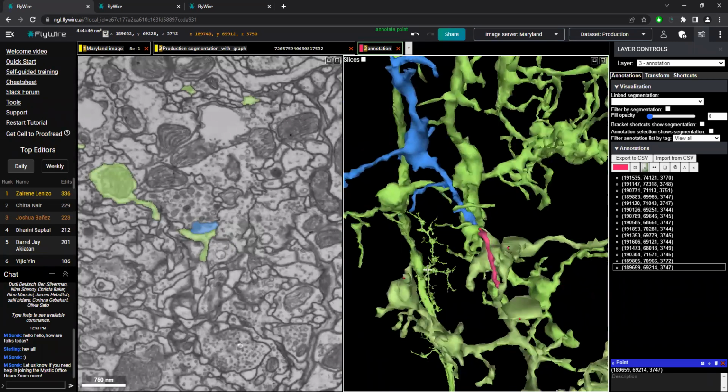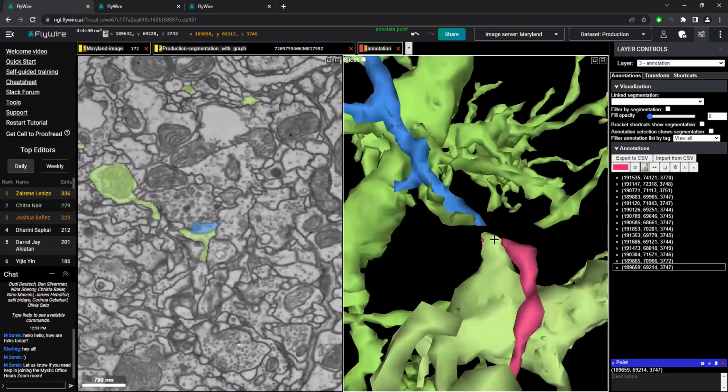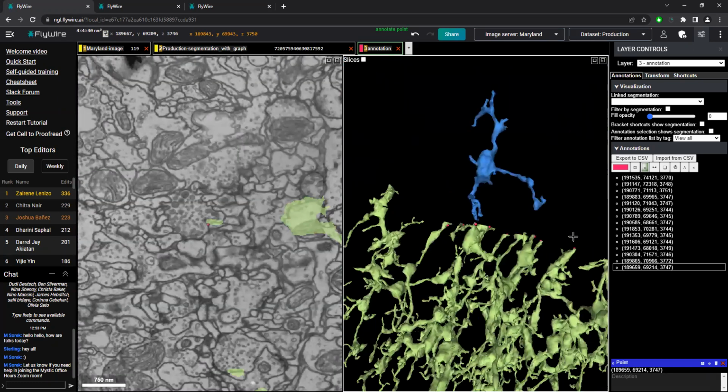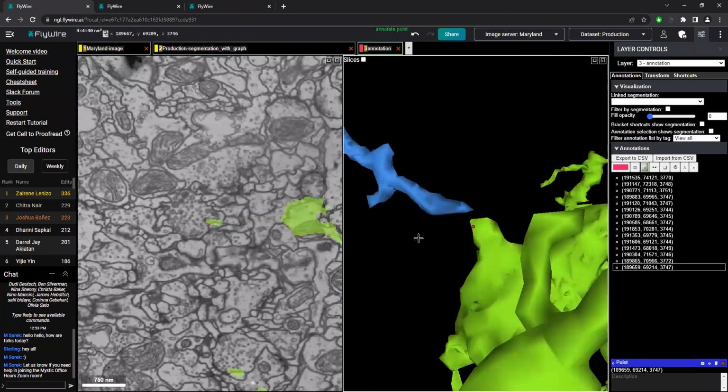It's too big and messy, so I definitely do not continue for this part. There's a lot of clicking around that you do, and then going like that, this ends the structure. Based on this type of cell and what we're seeing over here where there isn't that cutoff, this looks good for adding on. So I'm really going to go ahead and keep that.